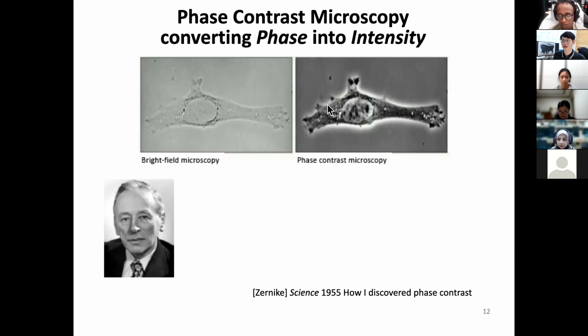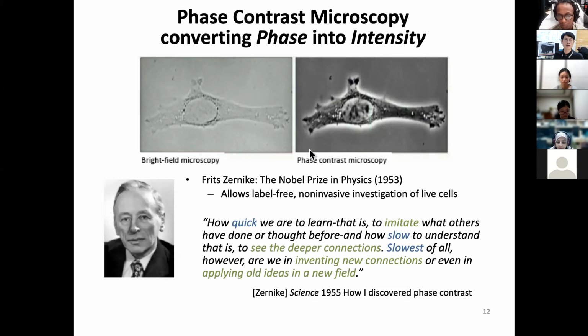That gave a revolutionary impact, and that gave him the Nobel Prize in Physics in 1953. Why? Because it's label-free, you don't do anything, so it's a non-invasive investigation. So this was a revolution. But you will realize, in my formal letter signature, I have this quote. I want to read this one for you, and I expect you to always think like this, to become a real inventor of something important. That's something I want to share with you.